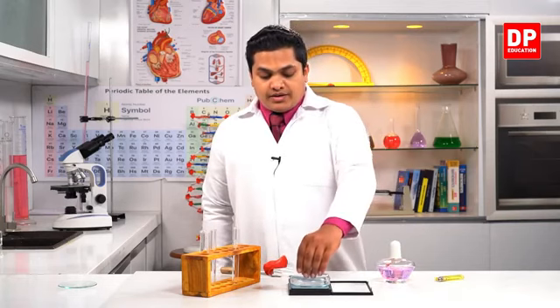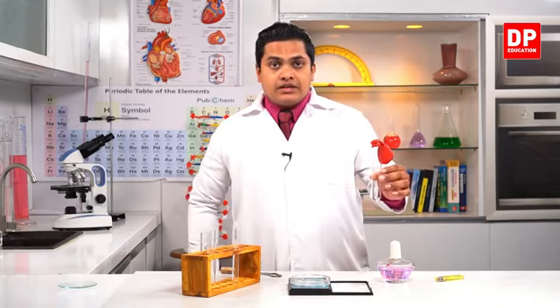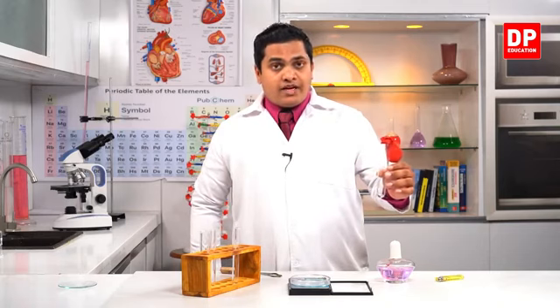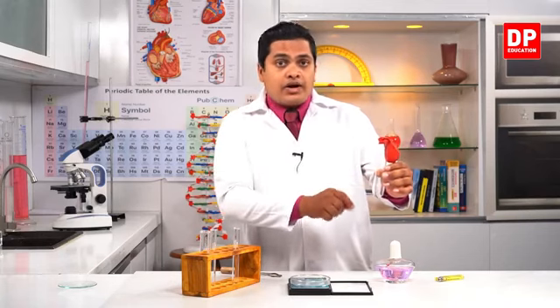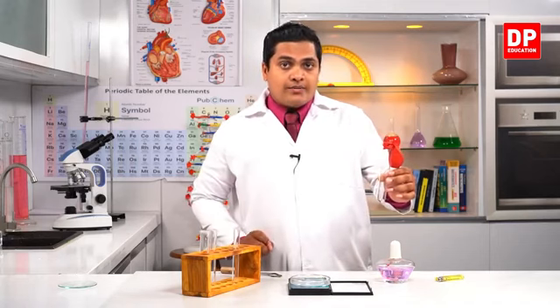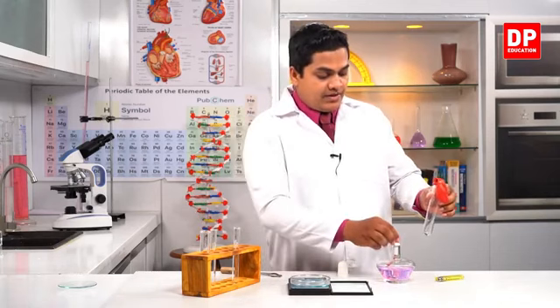Now I'm going to take it out, and I'm going to heat up this boiling tube. When I heat this boiling tube, the matchstick heads inside will burn out and undergo a chemical reaction, right? So I'll heat it by using the spirit lamp in here.